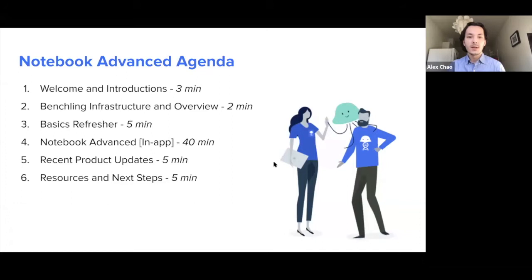To start us off with an agenda, we're going to welcome everyone who's here on this webinar, as well as the folks on the Benchling team that are here to support you today. We'll then dive right into an infrastructure and overview of the Benchling platform. We'll then spend some time giving a refresher of some of the basics that we covered in our last Benchling Bootcamp session. We'll then be spending the majority of our time within the Benchling platform, going through some advanced notebook exercises.